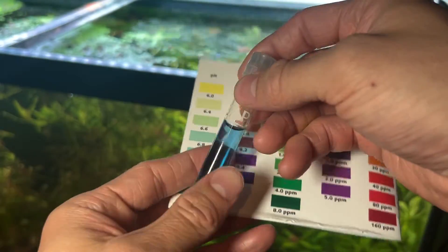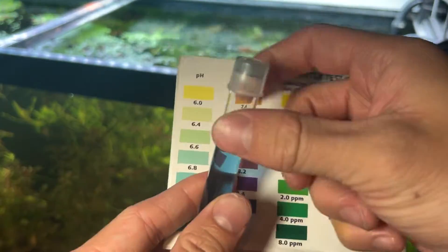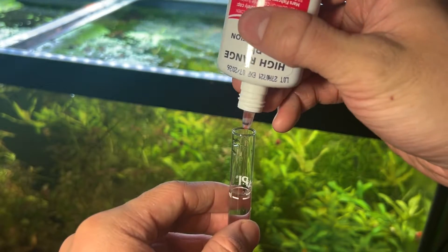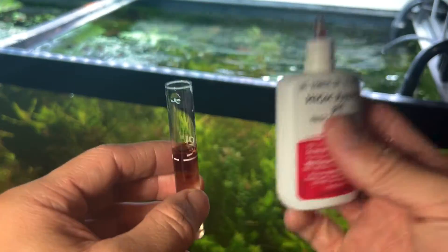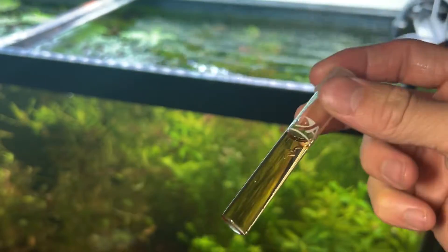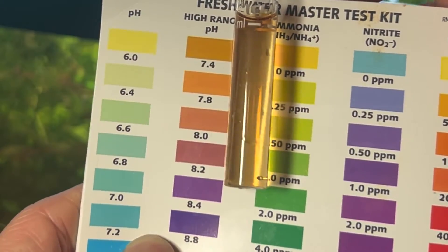Since mine is alkaline, we're going to test with the high range pH test solution. We'll dump out the tube and add more tank water. Now we add five drops of the high range pH solution and give it a good mix. Now comparing it to the high pH range on the chart, using a white background, we're sitting at about 7.8 pH — and that's how you test your pH.